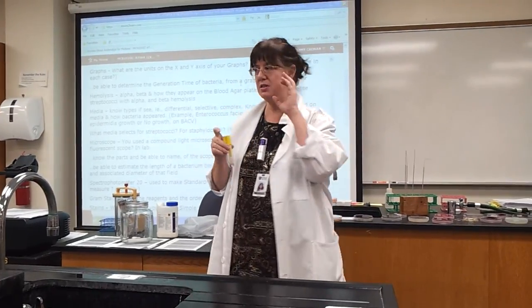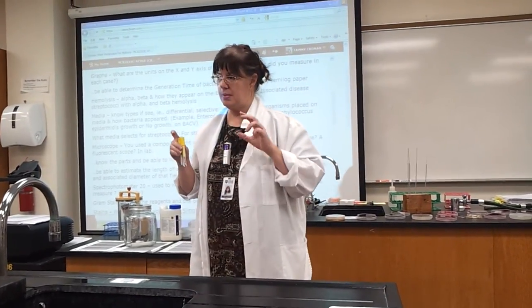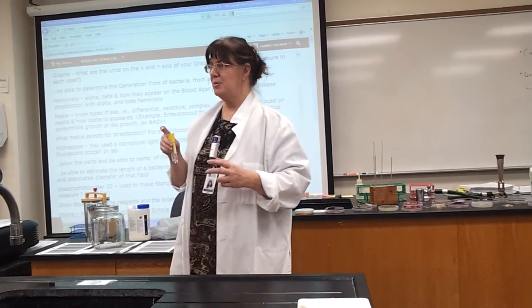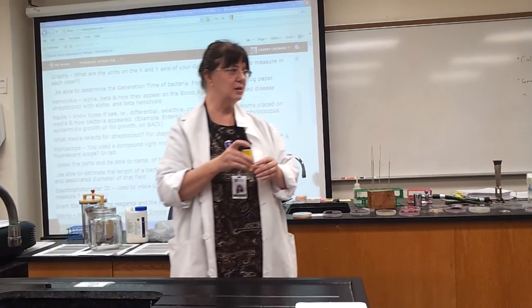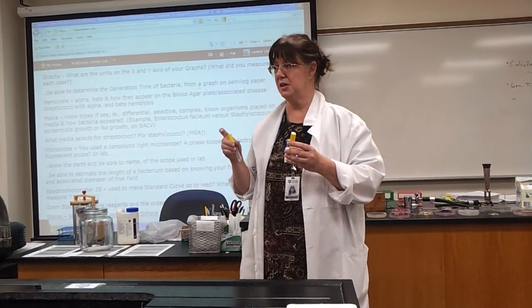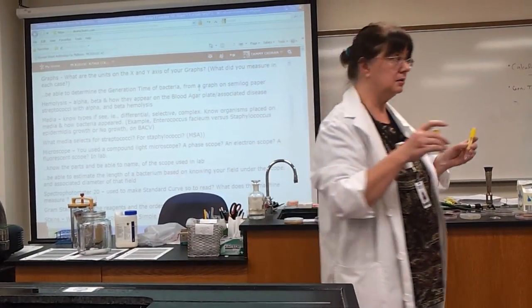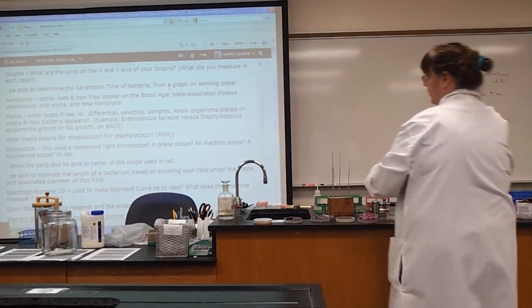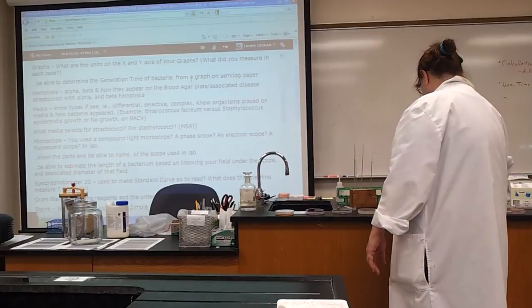Please, please, please don't mix up catalase with coagulase. People do that every single semester. I think it's because they sound alike and they both start with a C. But don't mix them up, okay? Try to work on that one. Practice on that one. Okay.